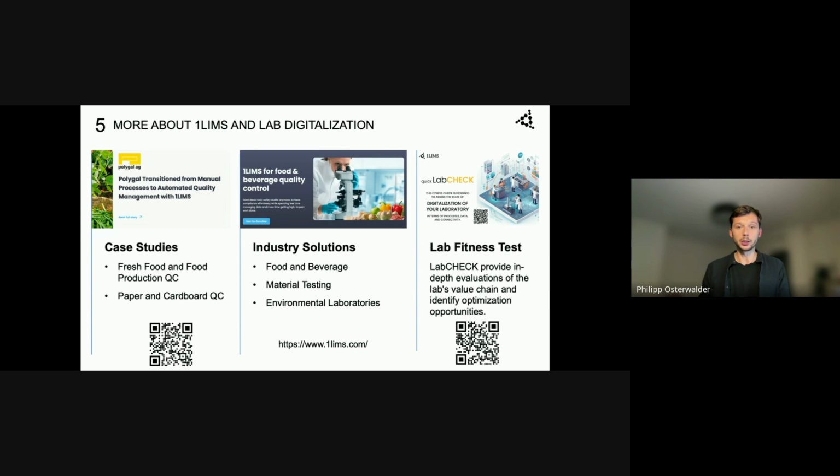And if you need more, just book a call for 50 minutes and we can talk to find out what's your current state, what kind of requirements you have, and what's your future state. And with this information, we can already put together a personalized guide with an action plan, a cost indication, and also a roadmap with timeline to know what to do and when to do it, specifically created based on your requirements and current state.